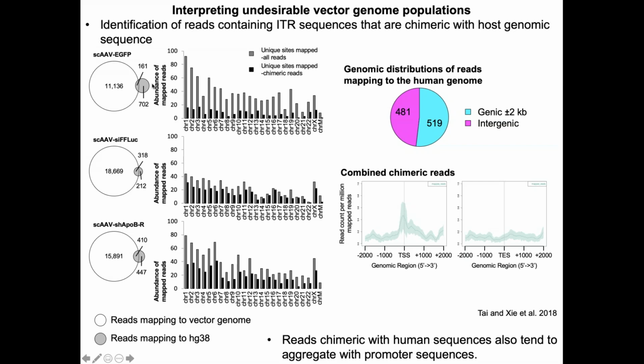But what was very puzzling for us initially was that a lot of these genomes that mapped properly to HG38, which is the human genome, we also get reads that are also mapping to the vector genome sequence. Originally, we thought that perhaps there were certain aspects of the sequence in these reads that match both the vector genome sequence as well as the human genome.